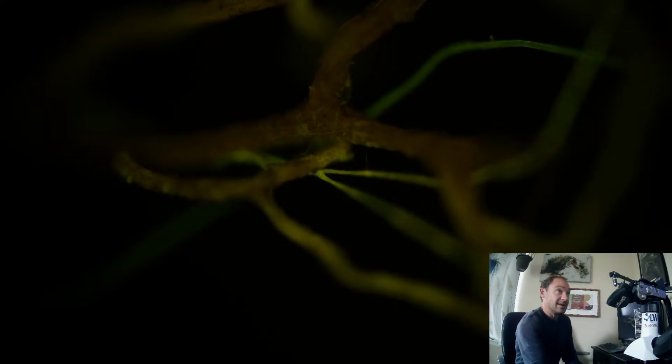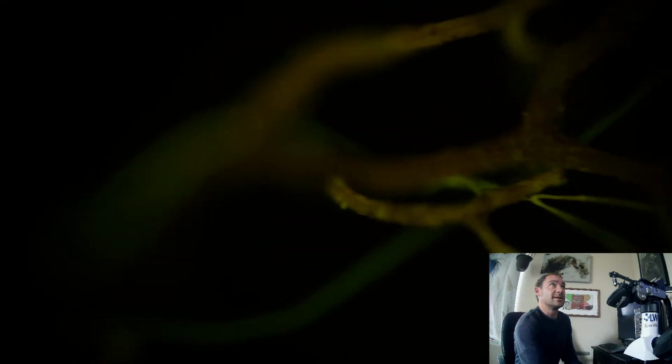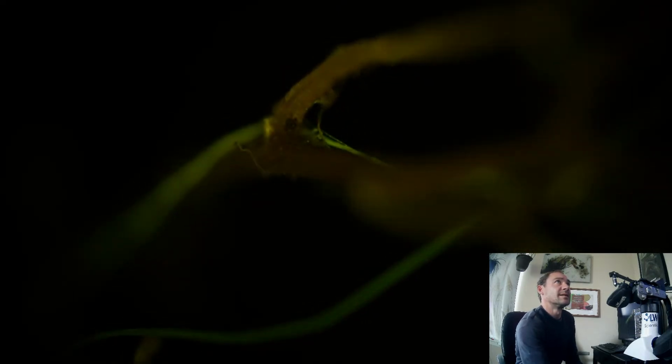Yeah, it could be where it sealed itself off. Because it's trying to repair itself, so it's oozing out some materials to seal that wound and protect itself. But wow, look at how bright that little root hair is.